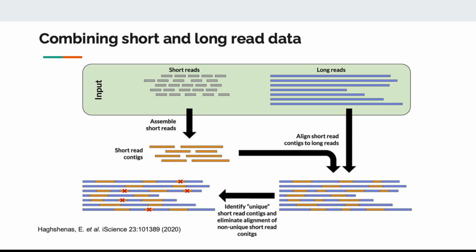Today, now that we have both next generation sequencing, which is short read, better throughput and more accurate, and third generation, which has longer reads, lower throughput, and is less accurate, people start to put these two technologies together. This is a strategy that I hope all of you will think about going forward. I think we are beyond the period where we select either short read or long read. Going forward, it's going to be a mix of the two.